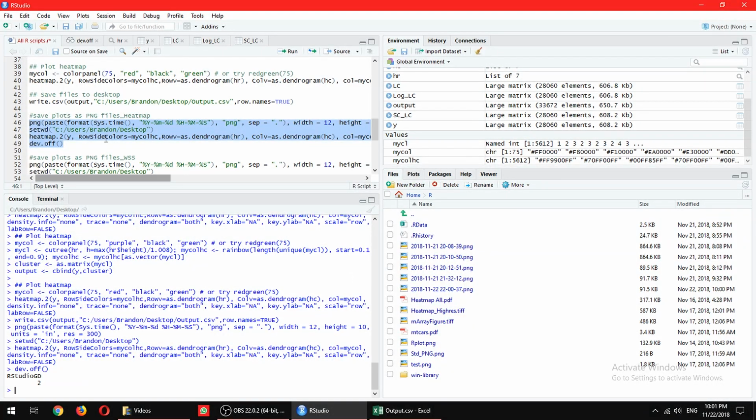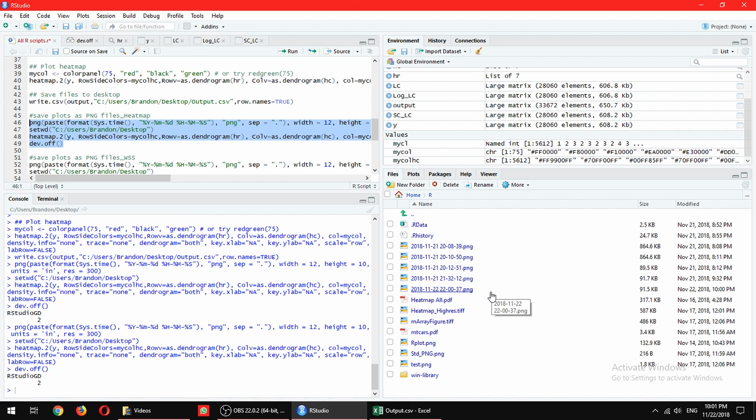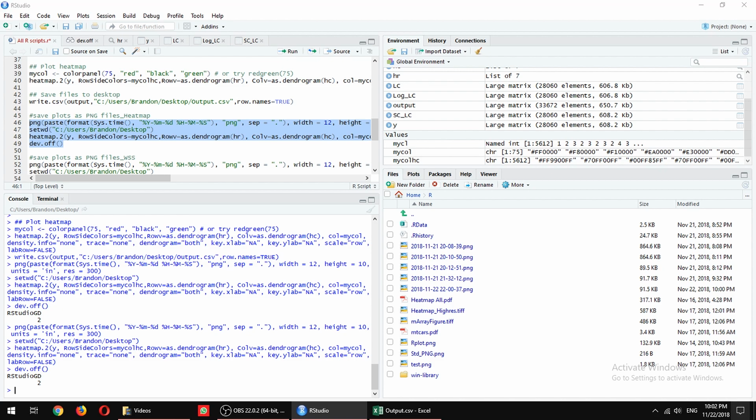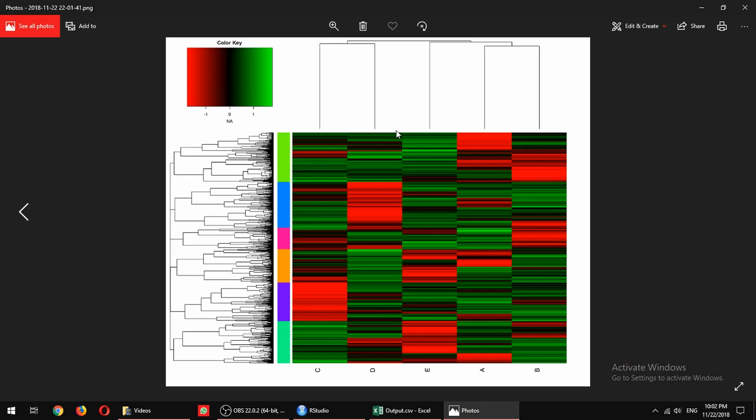So let's just make sure that we did not screw it up and I do not actually teach you the wrong stuff. Let's run it again, and you see a new file generated right here. Okay, 3, 2, 1. Yes. Okay, now it goes to my desktop. I have no idea how this works and why it does that. As you can see, we have exactly the same thing.